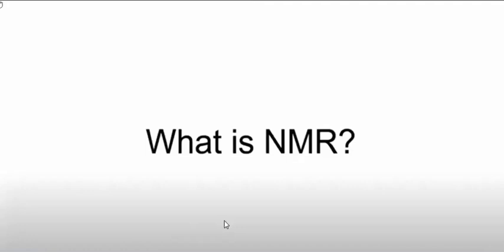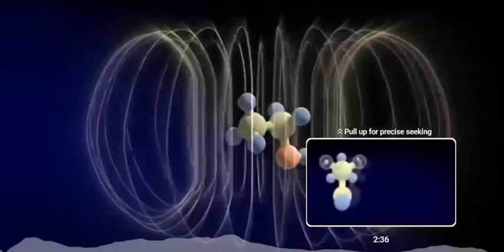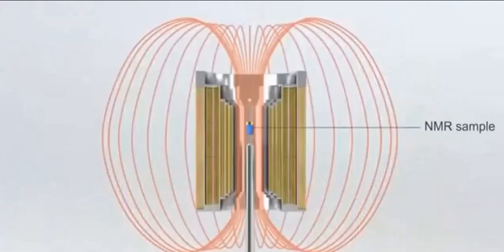What is NMR? NMR is a more advanced spectroscopic technique to determine the structure of a molecule, which is derived from the interaction of matter with radio frequency waves. This spectroscopy uses radio frequency.